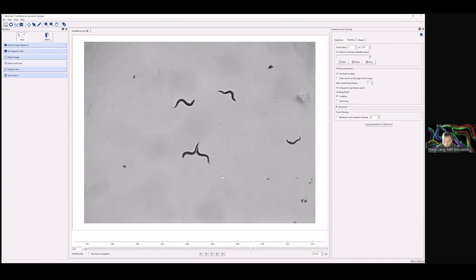Actually, this is where WormLab now has some unique advantages utilizing this multiple hypothesis tracking algorithm, which applies a set of possible worm locations across time, generating, you can think of it like a decision tree structure. Entanglements or self-overlaps between worms can be properly resolved by finding the best fit across frames. That is, which branch of this decision tree actually matches the actual worm path.